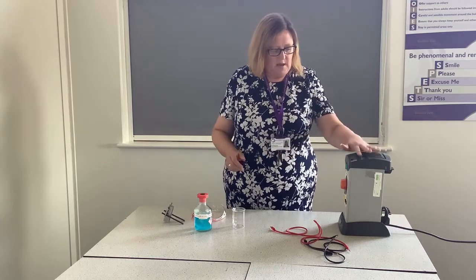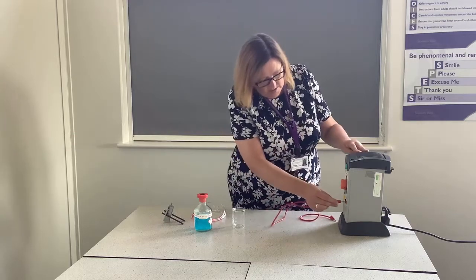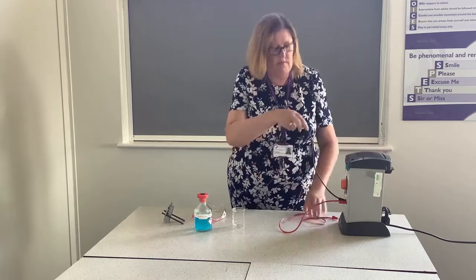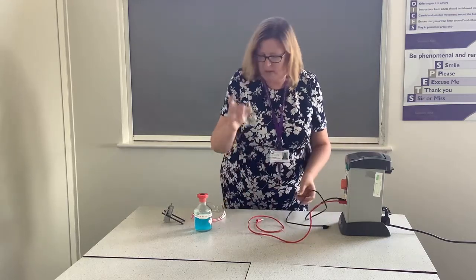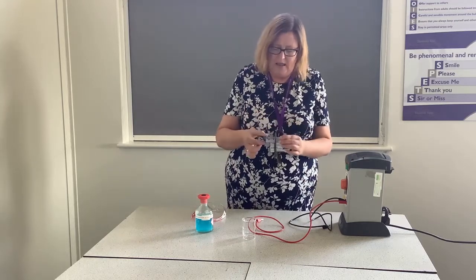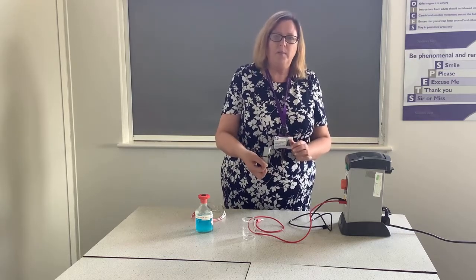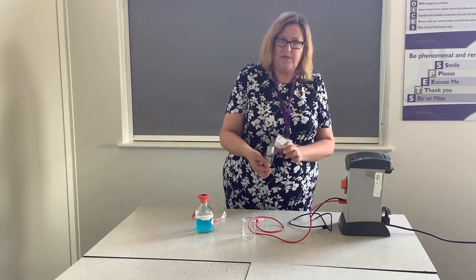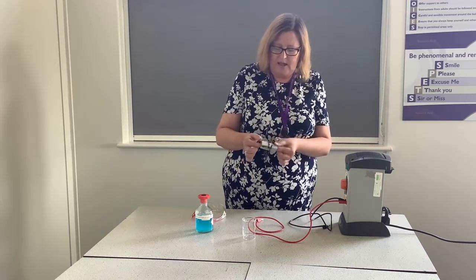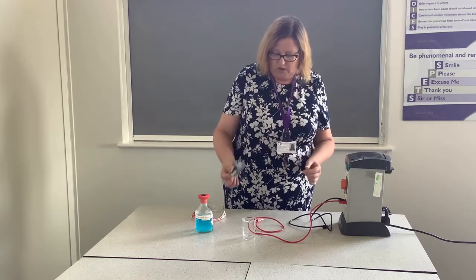To do this we're going to need a power pack and some electrodes — I'm just going to plug these into our power pack — and then we're going to need a beaker to hold our substance. This contraption simply allows us to have two carbon electrodes. We use carbon because it's very unreactive so it won't interfere with the reaction, but it does conduct electricity. The mechanism it's put into just stops the two electrodes touching each other during the experiment.